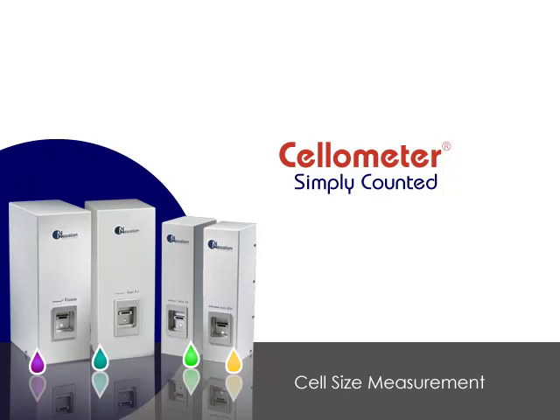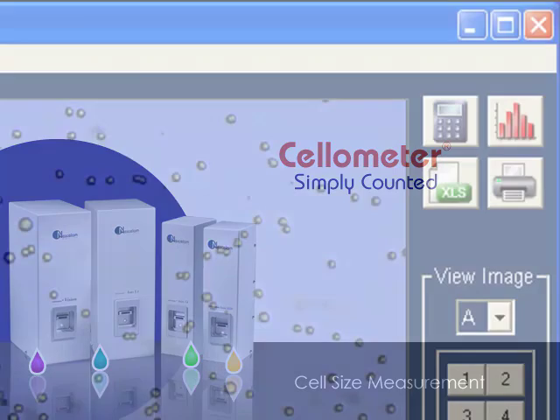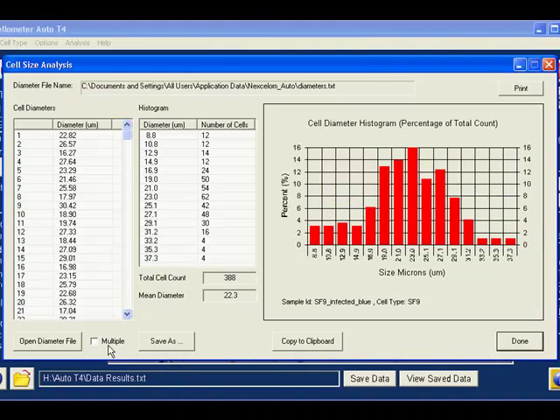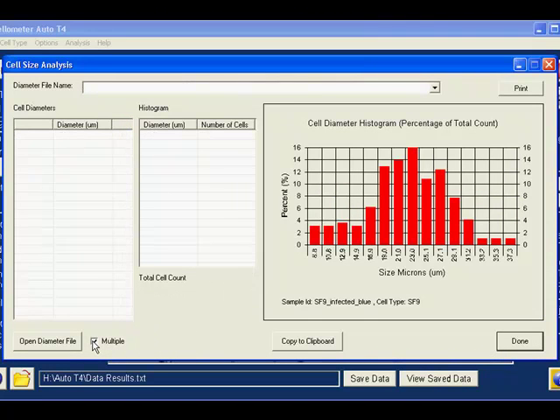Cellometer automated cell counters, unlike manual counting, measure both individual and mean cell sizes and can generate size distribution histograms for all counted cells.